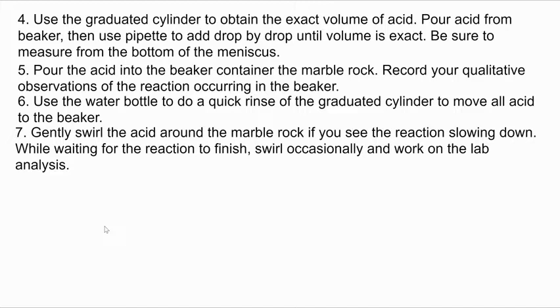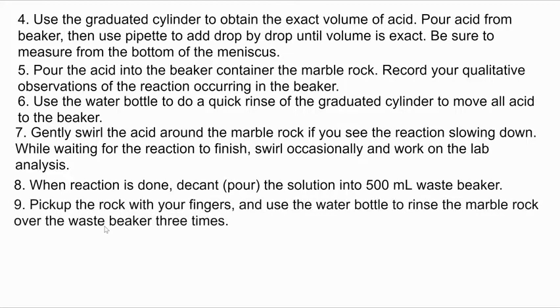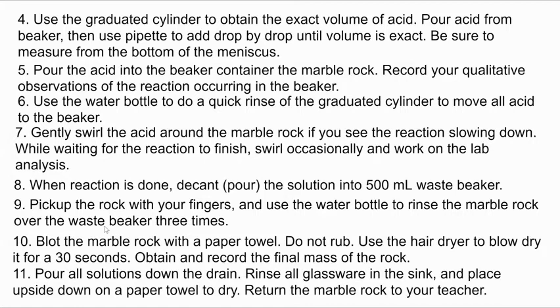Wait for the reaction to completely finish, swirling occasionally and working on your lab analysis. When the reaction is done, decant, pour the solution into a 500 milliliter waste beaker while keeping the rock in the original beaker. And then pick up the marble rock with your fingers, using the water bottle to rinse the marble rock over the waste beaker 3 times. Then blot the marble rock with a paper towel. Blot means to just gently push down. Don't rub, because we don't want to lose any of the solid remaining.